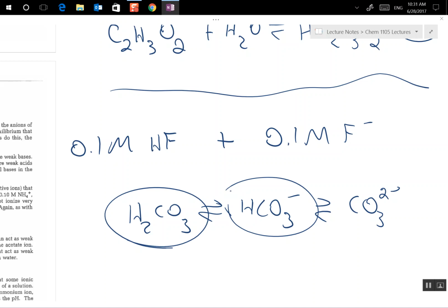Compared to when you add the HCl to pure water, the water pH changes very quickly. But if there's a buffer present, it will be maintained. And so that's the second part of this lab that you're going to do. You're going to watch that pH of that buffer system being maintained. Okay? So that's that investigation. Okay. So that will be Monday's lab.